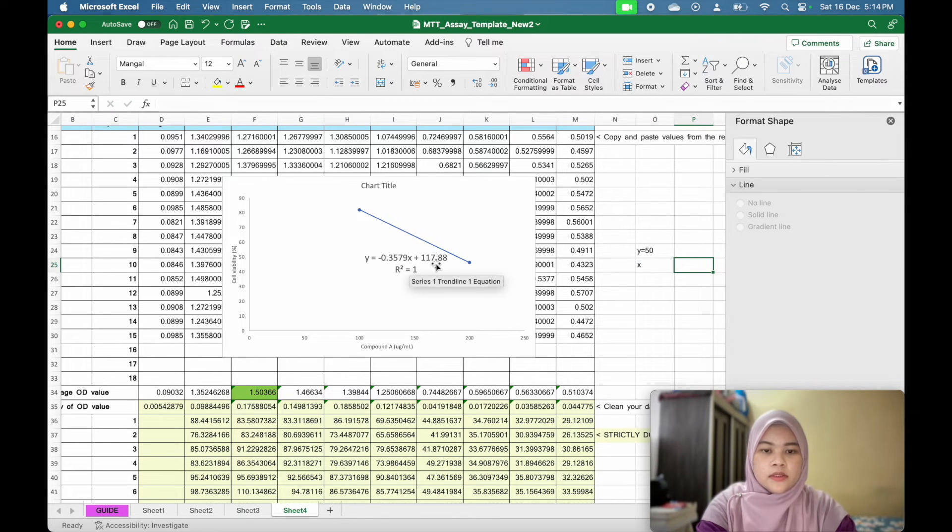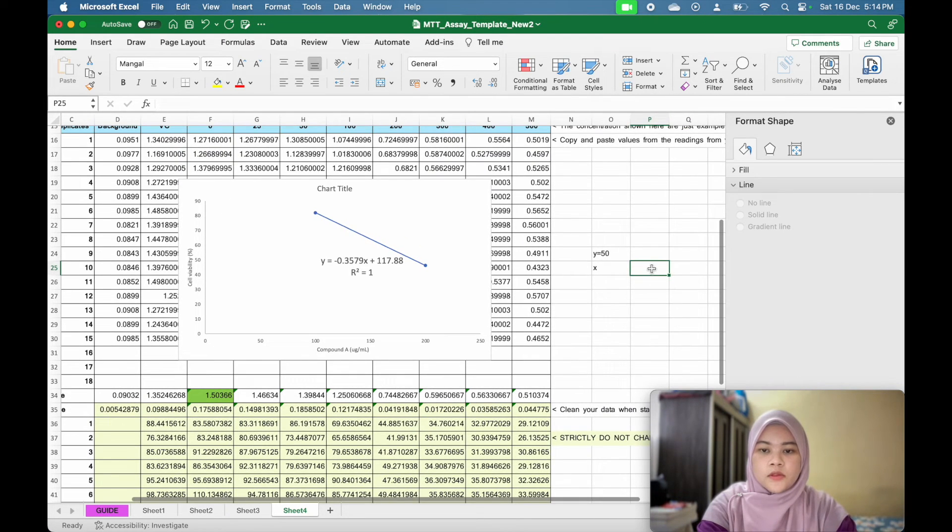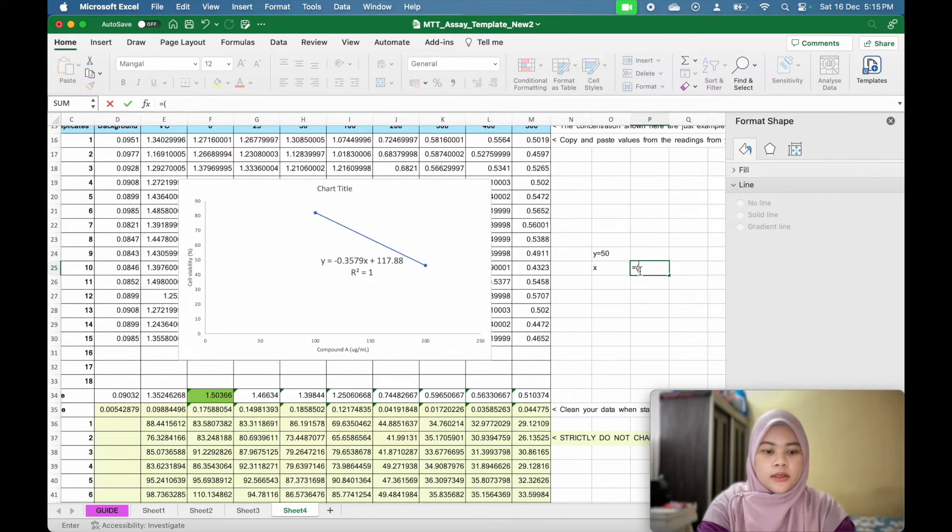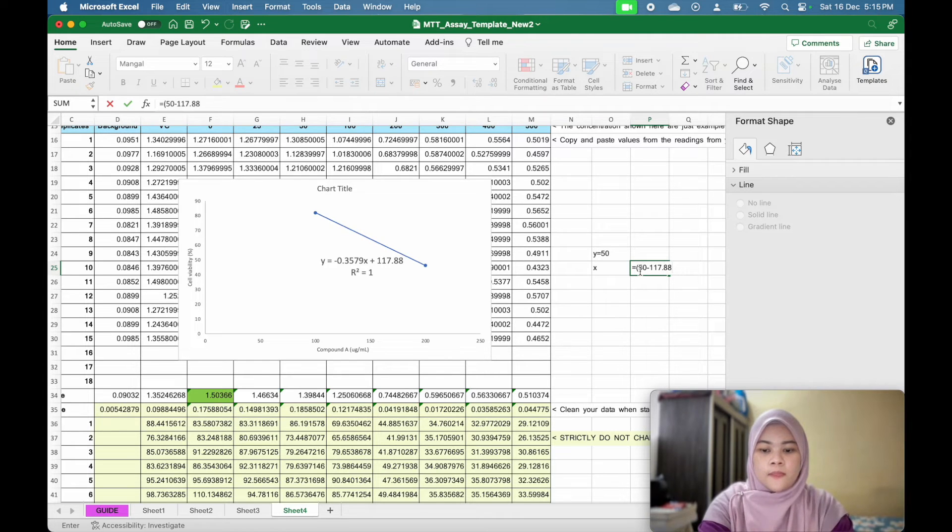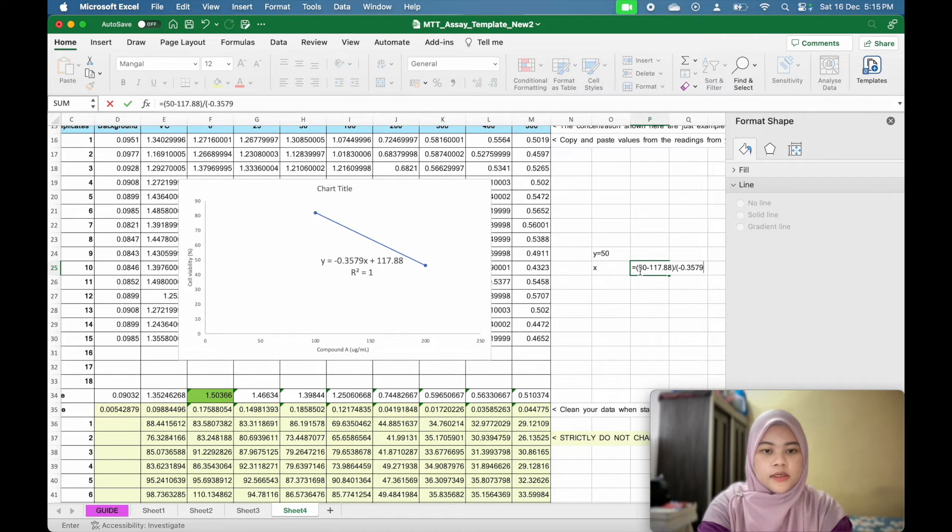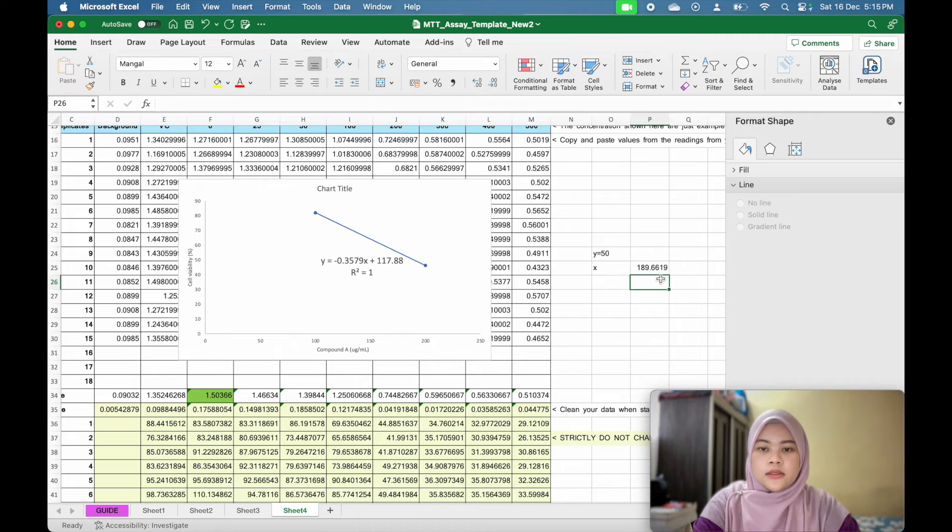117.88 divided by negative 0.3579. So X equal to, open bracket, 50 minus 117.88, close bracket and divide by negative 0.3579. And click enter.